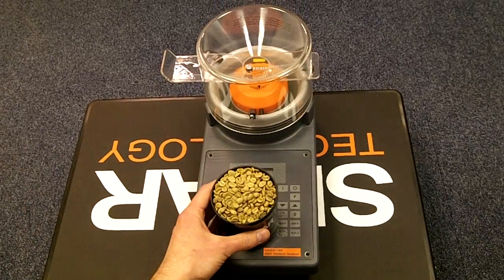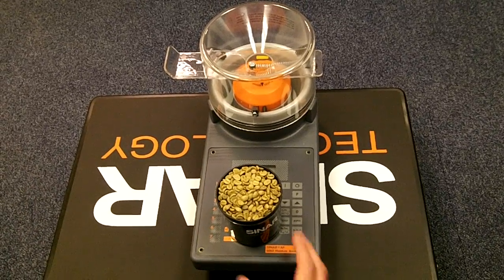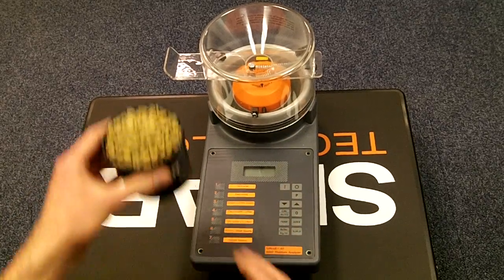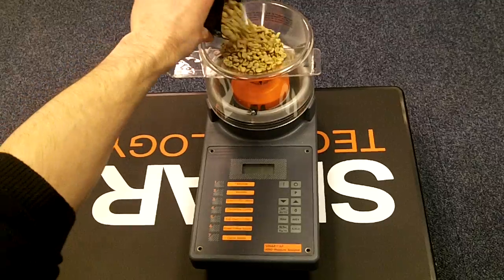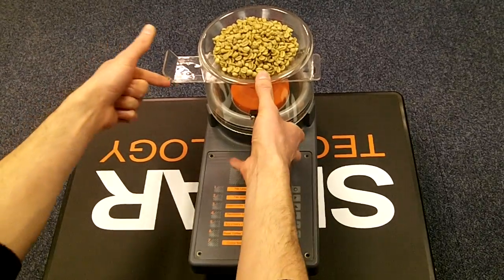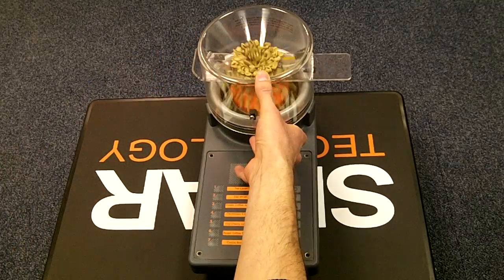Fill your sample beaker with sample so that it's filled to the top and then strike it off with the strike off blade. Pour this into the filling hopper and then push up gently on the slide to load the cell.